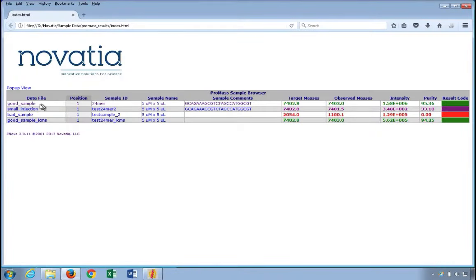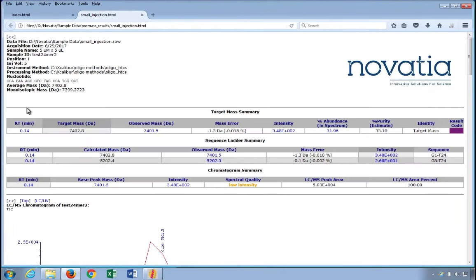Something else to note about the index page is that clicking on one of the samples will open a detailed report in a new tab. This way, your sample list will be open while you are reviewing data for any given sample.